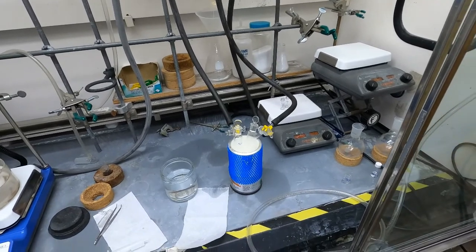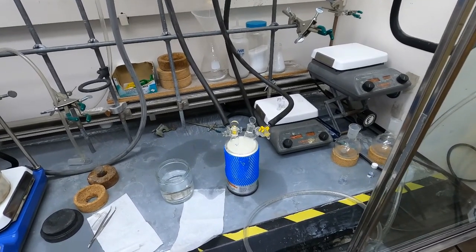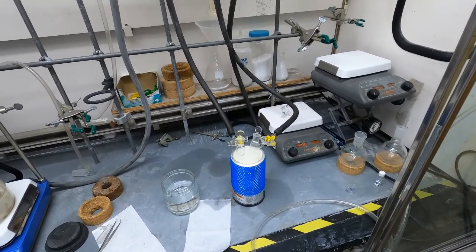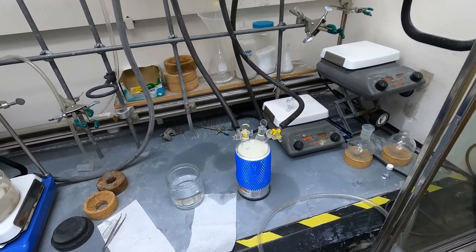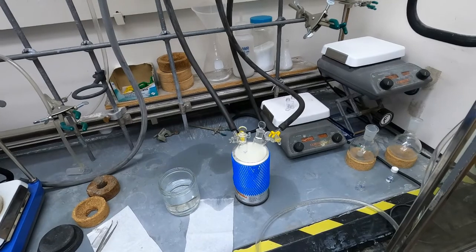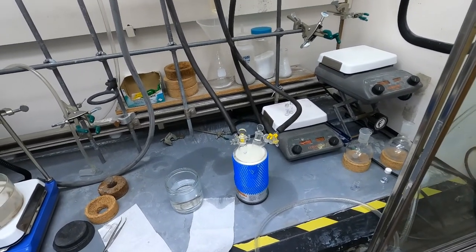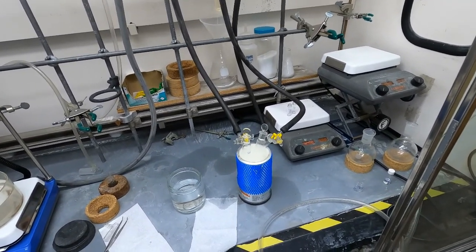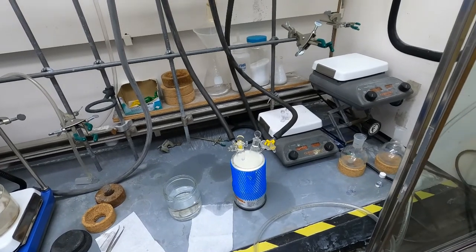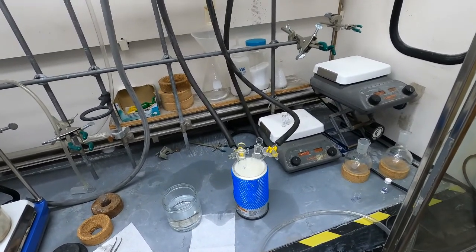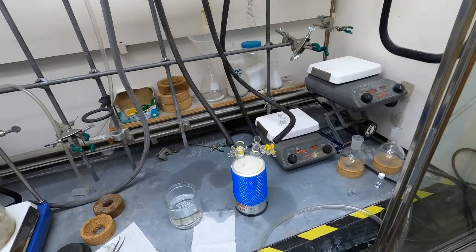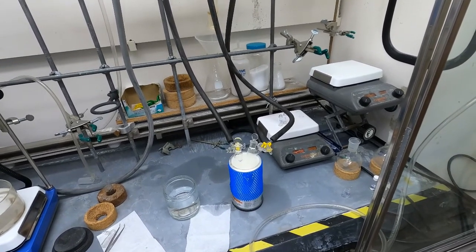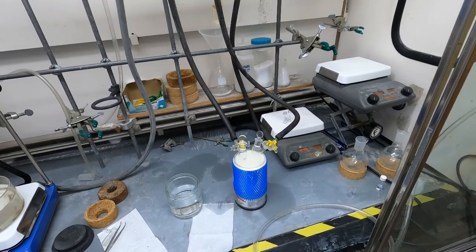After we've exposed the tubes to vacuum for about five minutes, we're going to close the stopcocks, take the tubes out of the liquid nitrogen, and then thaw them in a water bath. By thawing them, all the gas that was dissolved in the solvent will bubble out back into the evacuated head space. We'll repeat that process a few more times. This is a good way to get all of the gas both in the head space and that's dissolved in your reaction or your solvent out.